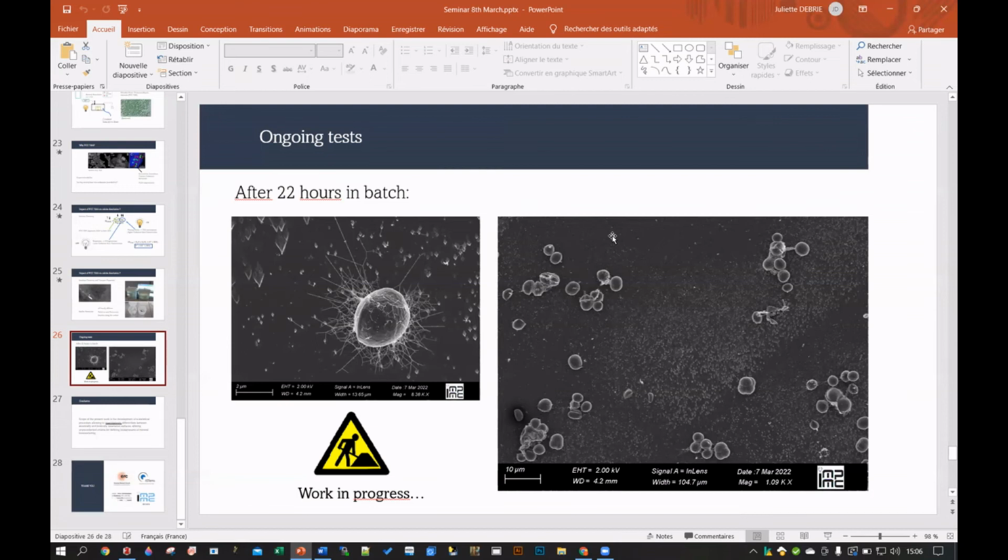I would expect the same increase. Because you're changing the recipe, the growth media: now this is in sodium nitrate and sodium bicarbonate only, whereas the regular standard way of doing this is in BG11, which has different components. So I'm just curious how the pH increases in just that. Actually, in BG11, the final pH was 9.5, whereas in the simple medium with cells, the final pH was 10.